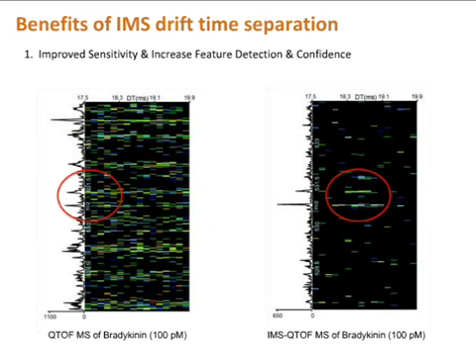However, in the IMS, what we saw is that the IMS was able to concentrate the peak into just a small drift time area, and it was able to move the noise to a different place in the separation, or it was able to eliminate some of the noise because you're trapping the ions, and there's a small amount of heat in that trap, and so it can get rid of chemical noise and get rid of solvent clusters.